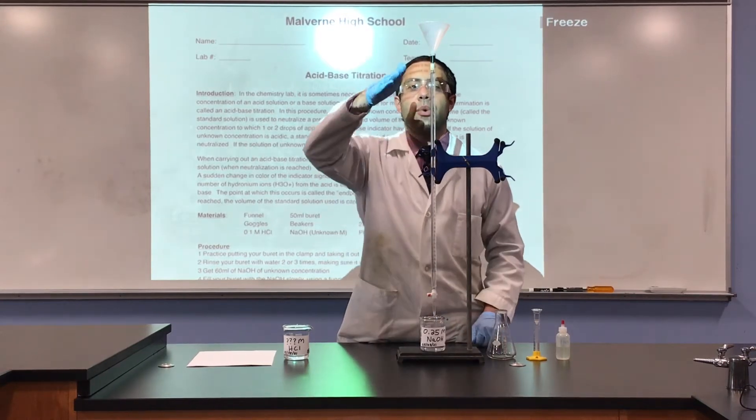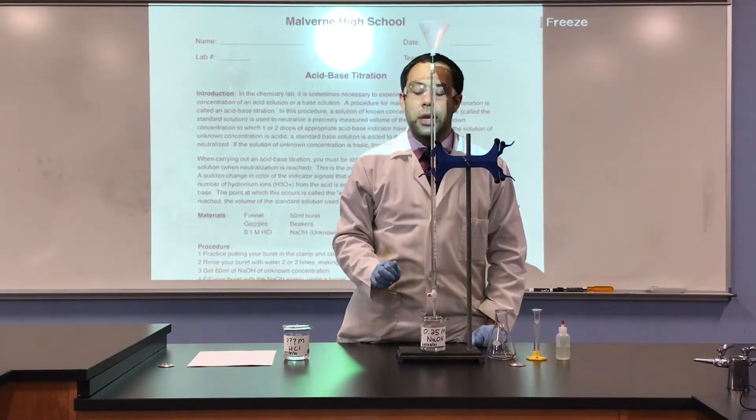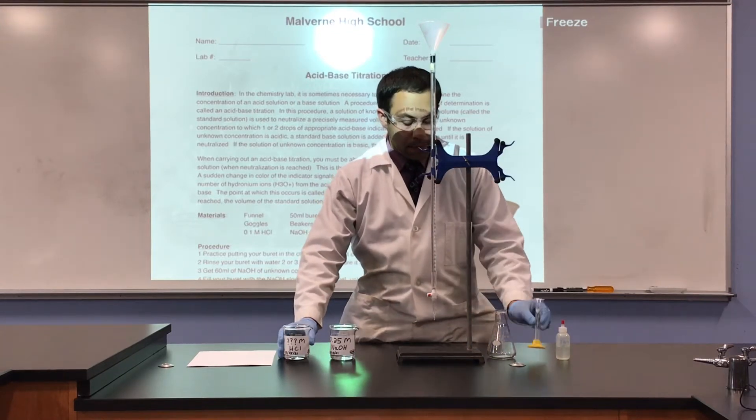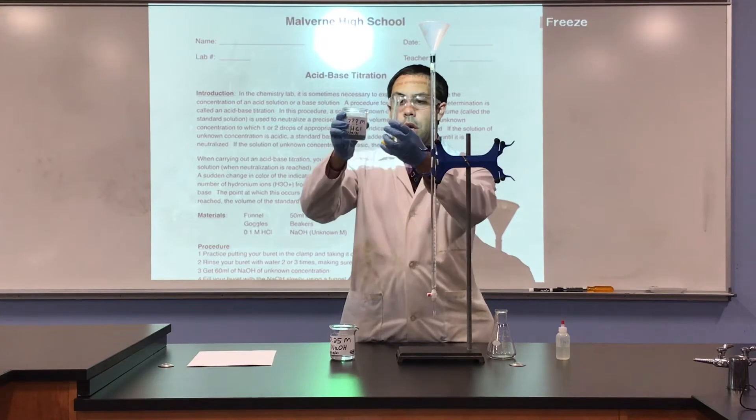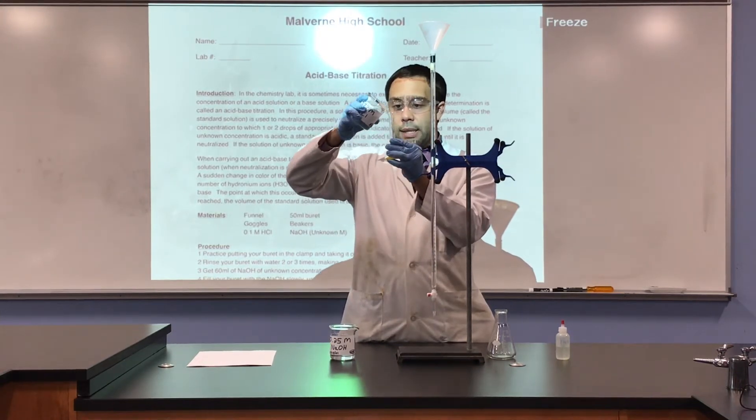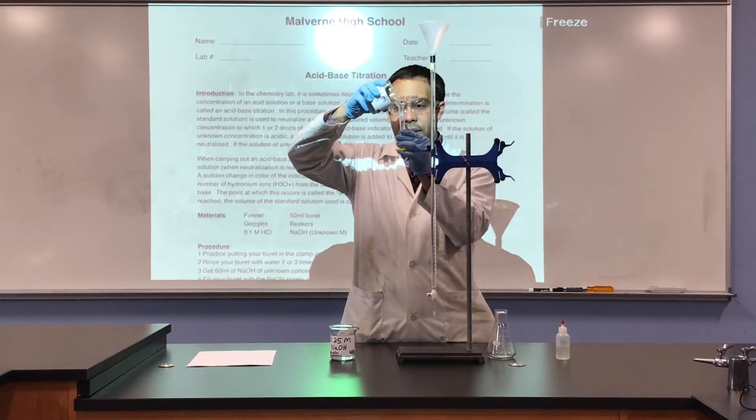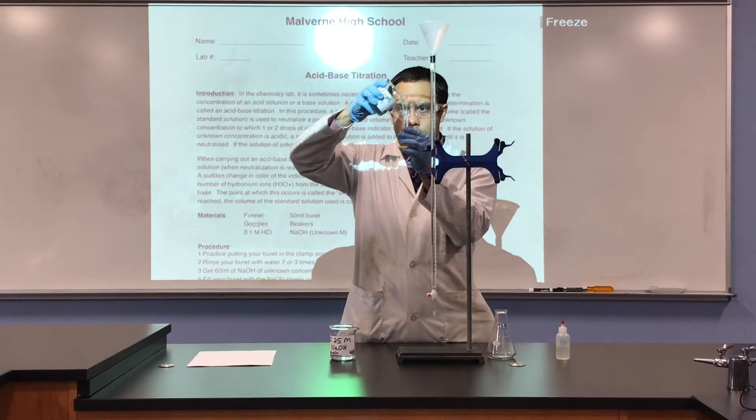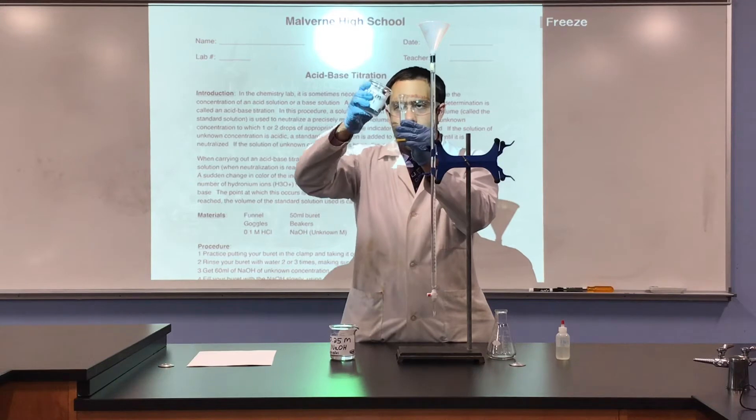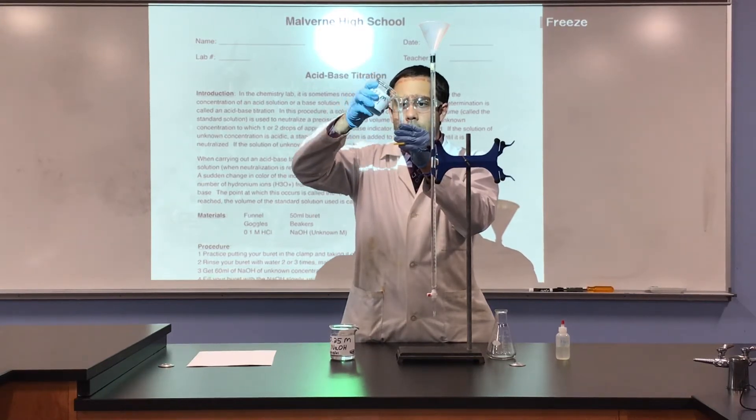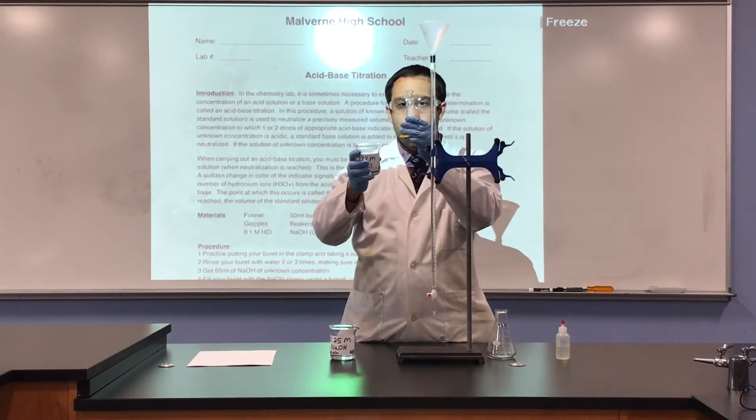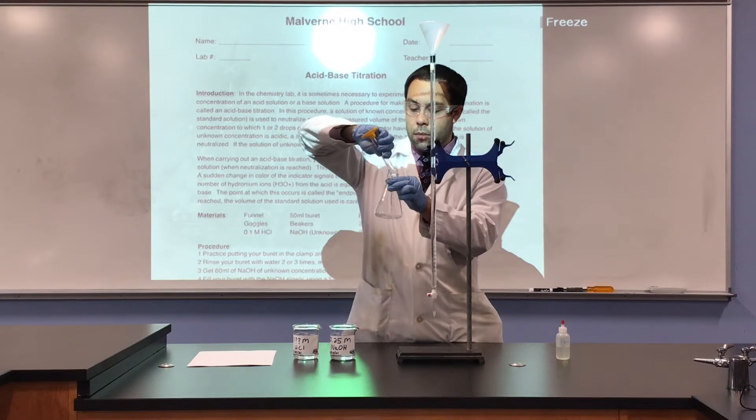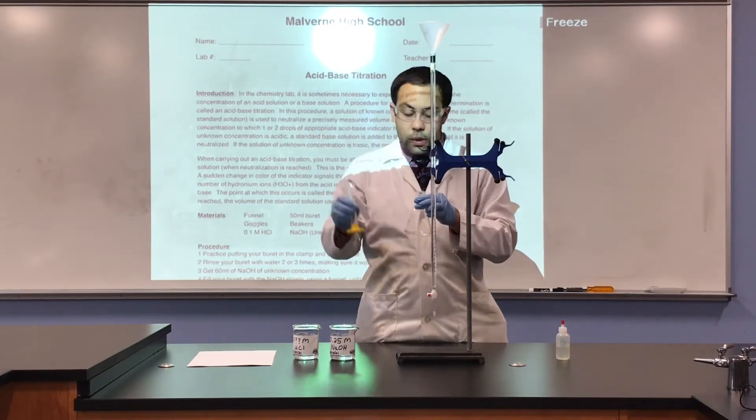Just like a graduated cylinder, you want the bottom of the meniscus on the zero milliliter mark. We can remove the base, set it aside, and now we'll worry about the acid. We are going to take 10 milliliters of acid. We take the graduated cylinder and raise the beaker and graduated cylinder to eye level so we get exactly 10 milliliters of acid. Once again, we want the bottom of the meniscus to touch the 10 milliliter mark. Perfect. 10 milliliters, we put it in our flask.